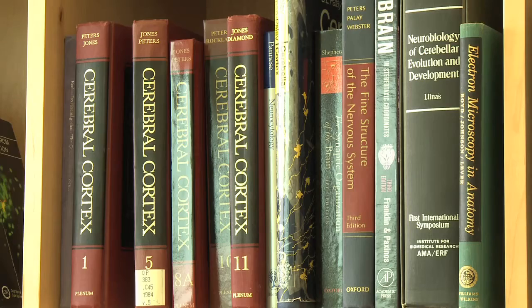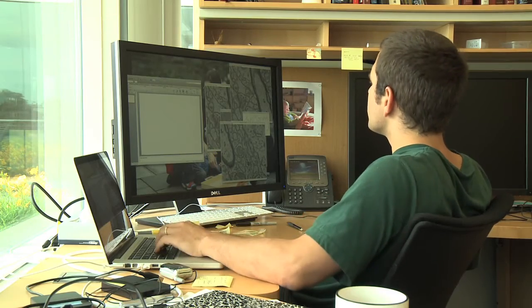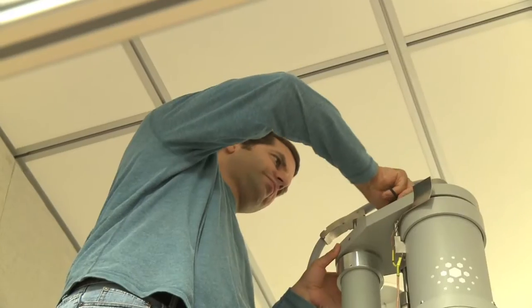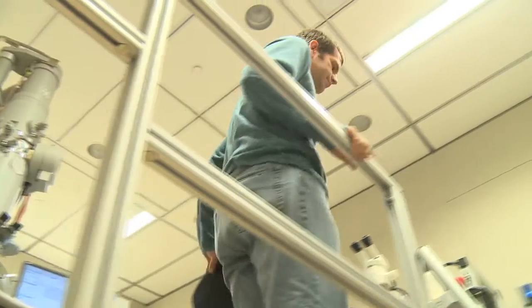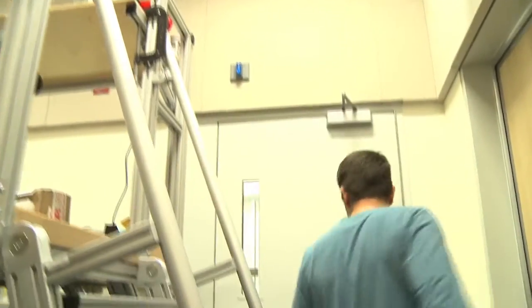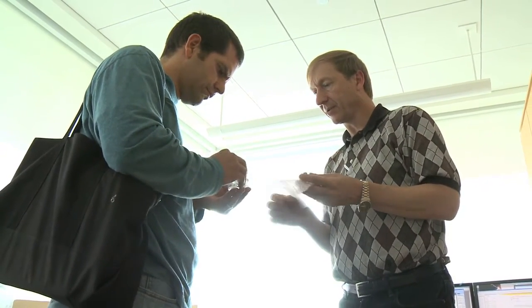I want to acquire single frame images and see if Eric can stitch them with off-the-shelf tools. Hot one, hot two, and ground — it looks like we actually need to make a little cable for it too.